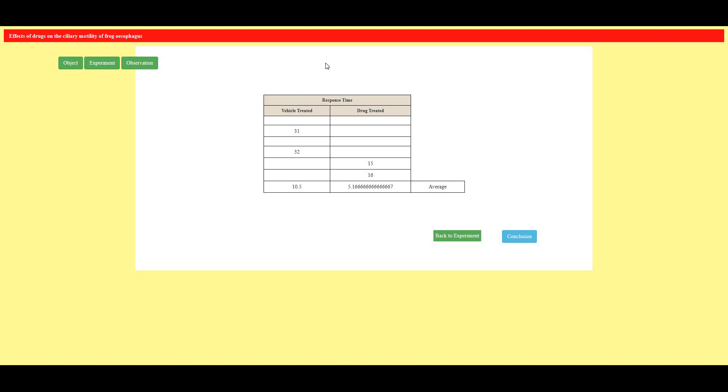So by this experiment dear all of you can understand that ciliary movement is rapid and faster on administering the cholinergic drug and if I administer anticholinergic drug the movement will be slower. So our practical experiment is getting matched with the theoretical experiment.